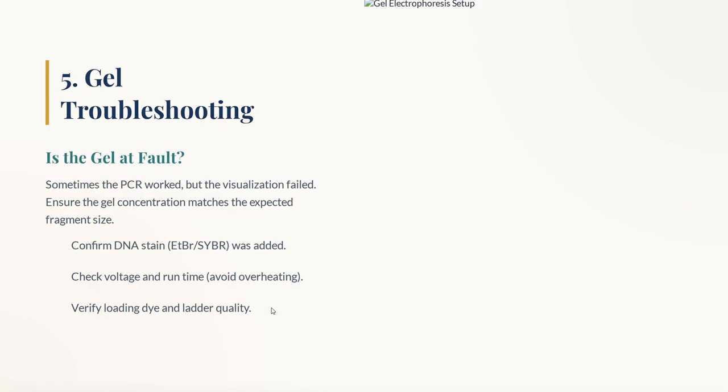If it is not, then you can be sure that your dilution has degraded, so you need to make a new dilution. Or if it is the stock, then the stock is also degraded, you need to procure a new stock, right? So this way you can troubleshoot your no bands situation, right?